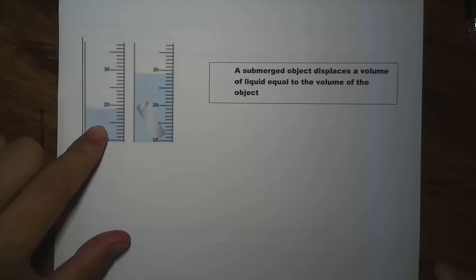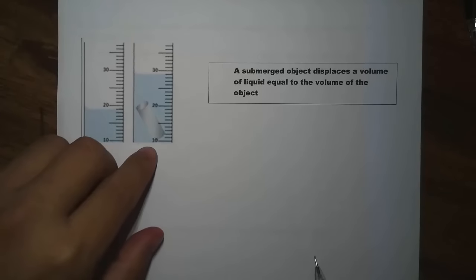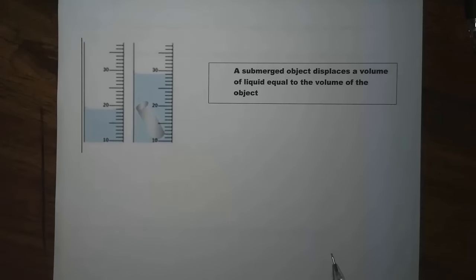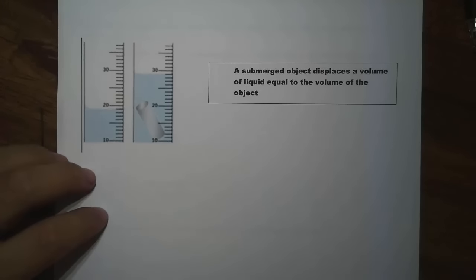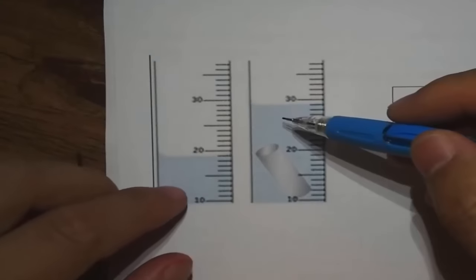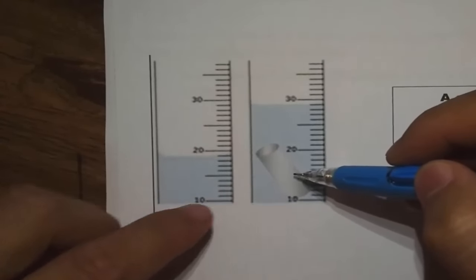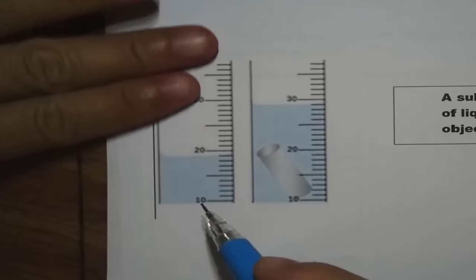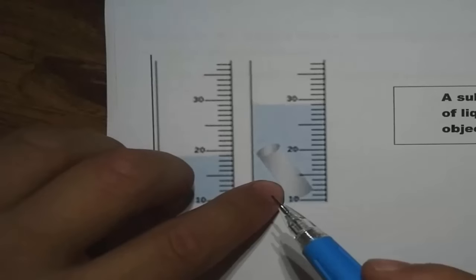First of all, we have water, and the water will be in a graduated cylinder or any container. What we have here is an object or a substance. We want to measure the volume of this object very quickly, and one way we can do it is using the water displacement method. How it works is you take the object and drop it in a graduated cylinder that contains water. Notice how there is a difference in the two readings, and that is because of the object here. It takes over the space right here and pushes the water up. And that difference from here to there is the volume of the object.